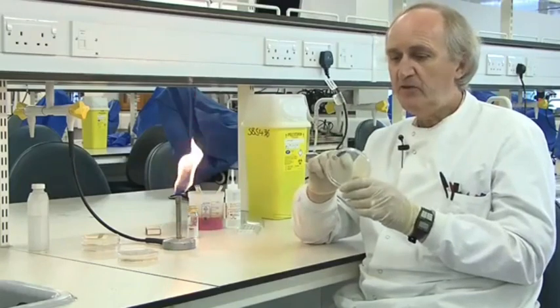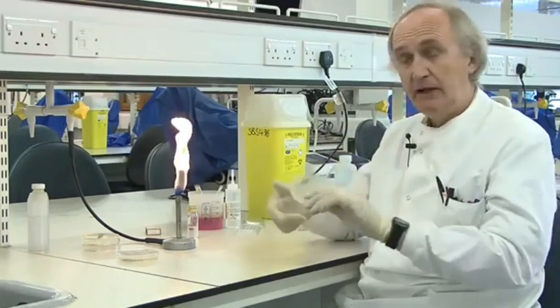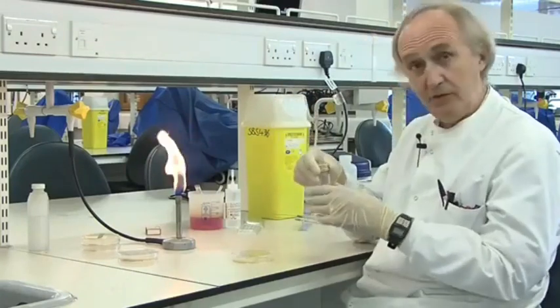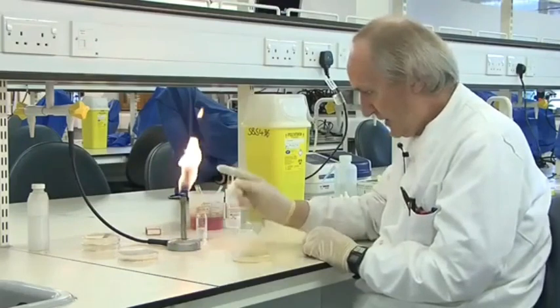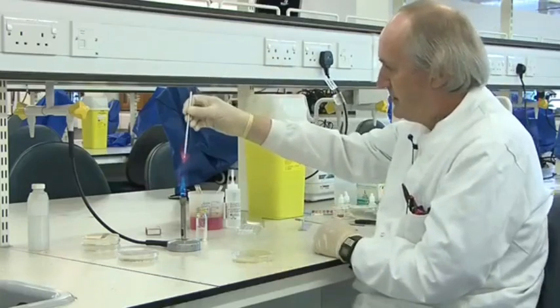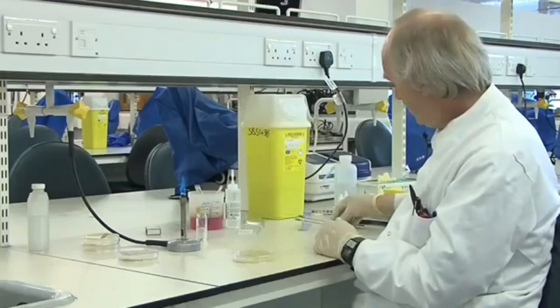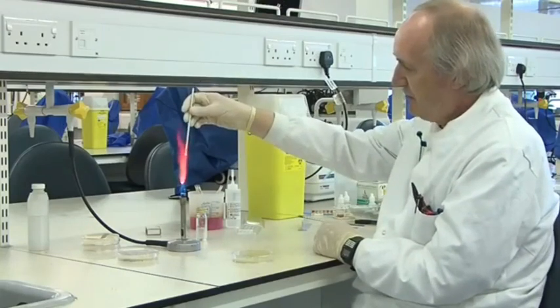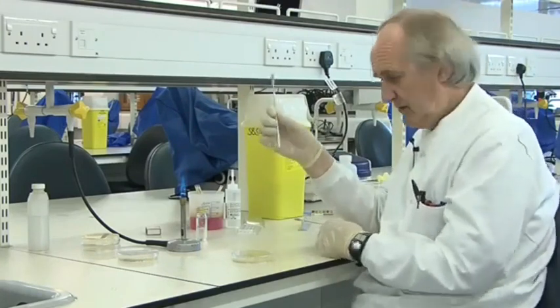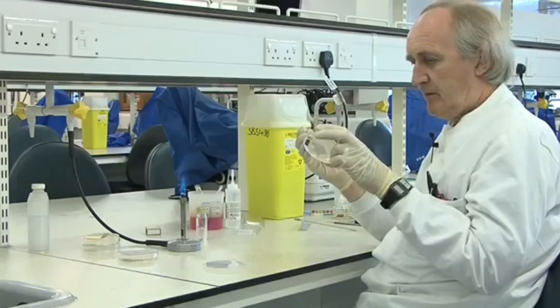So what we have to do when setting up an API 20E — a biochemical test strip — is pick off one colony and make an emulsion of it in sterile distilled water. This is 10 mils of sterile distilled water. I'm going to turn the Bunsen from the safe setting to the hot type. It's always useful to have two needles, because if you sterilize one, by the time you've sterilized the second one, the first one is cool and safe to use. So I'm going to pick off just one colony off this plate, and then I'm guaranteed it's a pure culture.